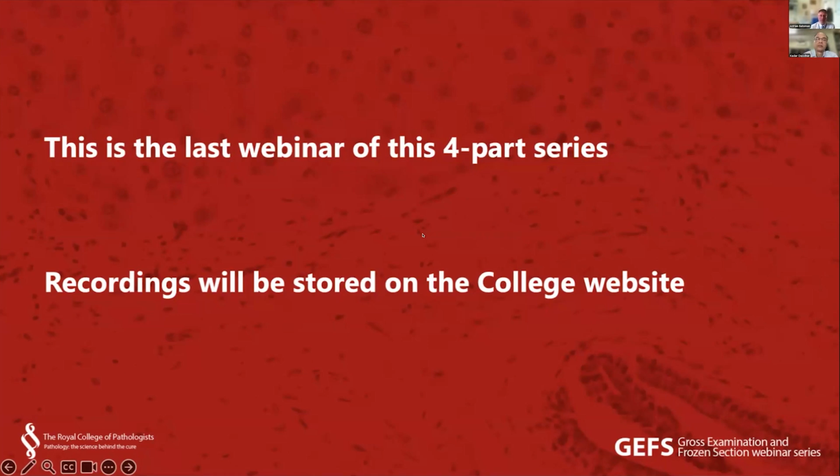So if you think you've got that situation, it may be reasonable to say this is an extramural tumor deposit likely to represent vascular or venous invasion. Sometimes you just can't tell, and then you just have to call it a tumor deposit. So I think you can just make a reasonable attempt to look for features that might make you think that something's in a vessel. Look for smooth muscle, look for the orphan artery sign, look to make sure there isn't evidence of perineural invasion. If none of those things are there, and there's no evidence at all of lymph node structure, you have to call it a tumor deposit. But that's still useful, because that's still a poor prognostic sign.